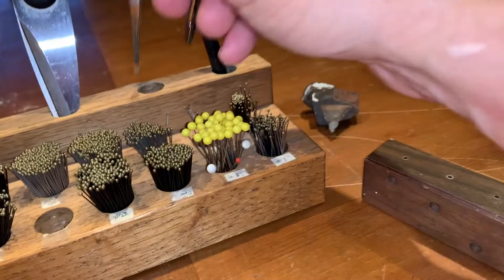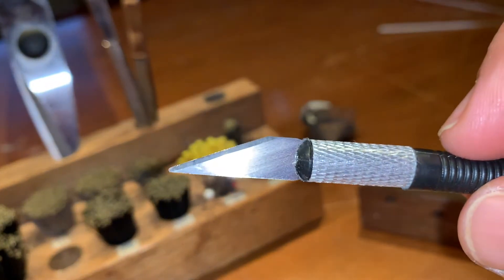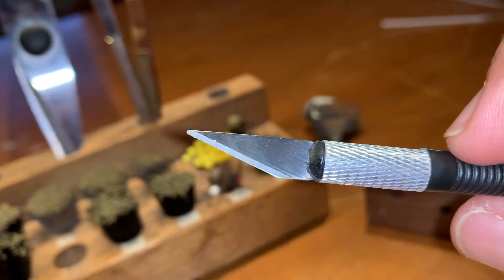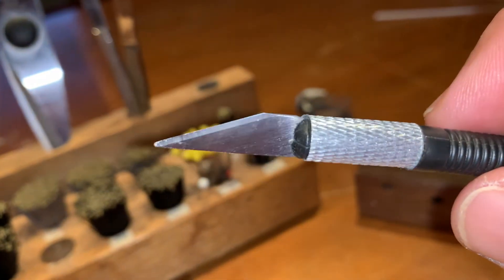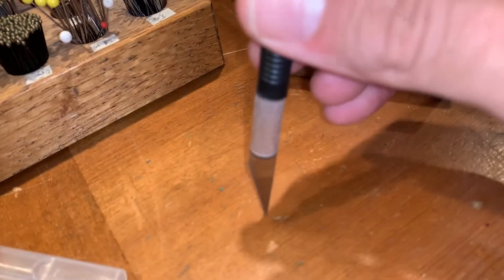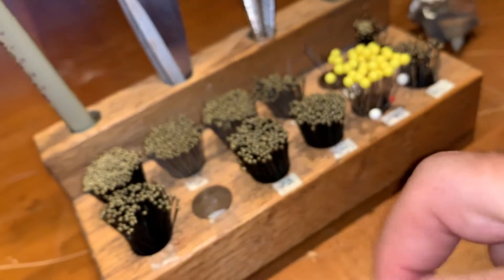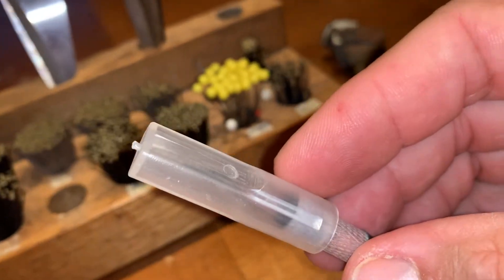Finally, we have an X-Acto knife. There's a little tendon that connects to the hindwing — on skippers and actually all butterflies — and certain species or families of moths and butterflies make it hard to get the hindwing into the right place. What we do is sever that little tendon underneath the hindwing. We use these for sphinx moths sometimes — that tendon can be very pesky when mounting sphinx moths. It's always a good thing to have an X-Acto knife around.